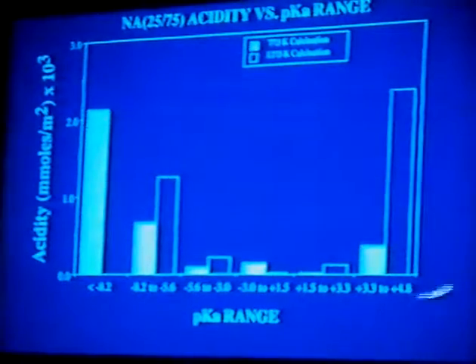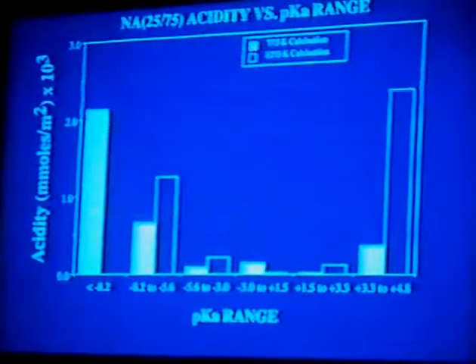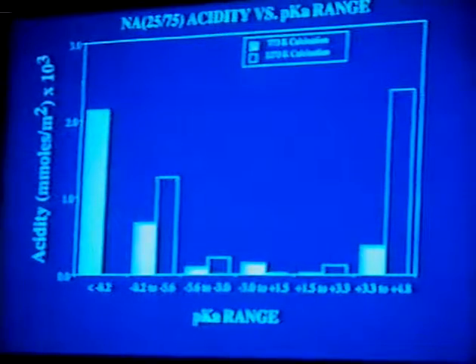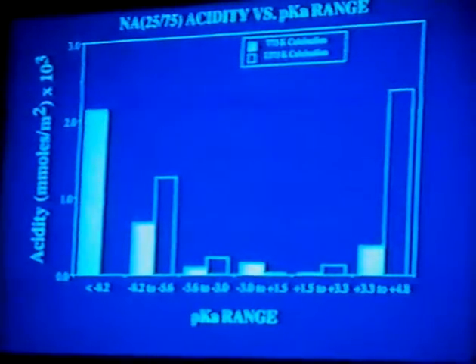In fact, this is probably the best sample we have in terms of resistance to thermal treatment, because in this sample we actually have more alumina than niobium, and stoichiometry will tell you that after the formation of the NbAlO4 compound, you will still have some alumina left, and I think we are picking up some residual weak acid sites on the alumina which has phase separated from the compound.